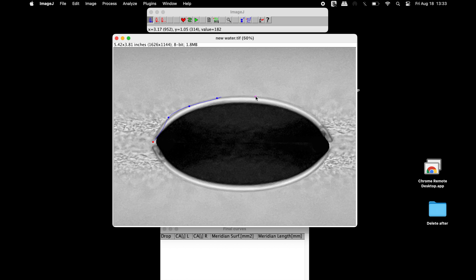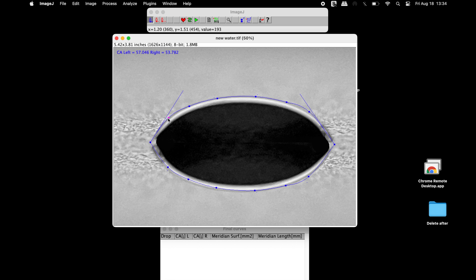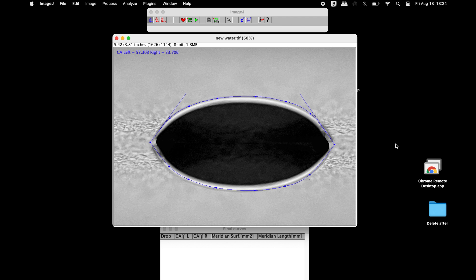Define the drop contour and double-click on the image after the last knot has been placed to close the spline. After the spline is complete, drag-and-drop operations may be used to change the knot placement. Once completed, the contact angles are displayed at the upper left-hand side of the image, showing both the left and right contact angles. This contact angle information can then be used to determine the surface free energy and wettability.